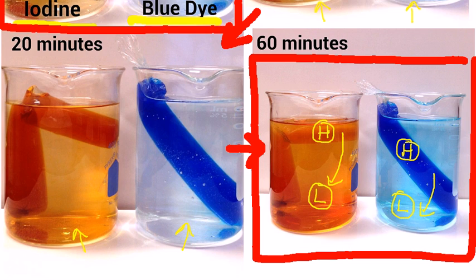So because diffusion always wants to create a state of equilibrium where everything is equal, you're going to have your movement of molecules from the high concentration inside of the bag to areas of low concentration outside of the bag, thus changing the color of the water outside of the cell. So this is the movement of molecules from high concentration to low by diffusion.